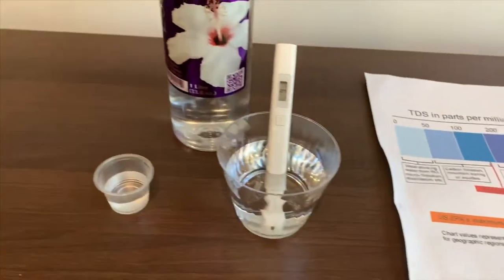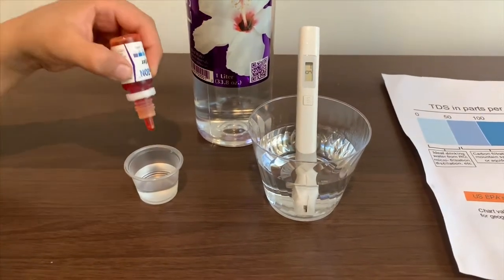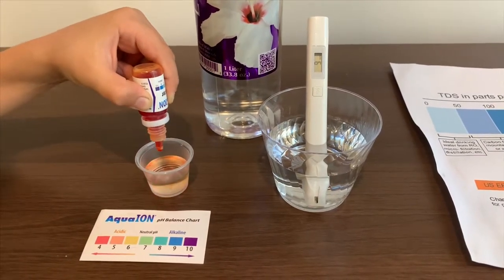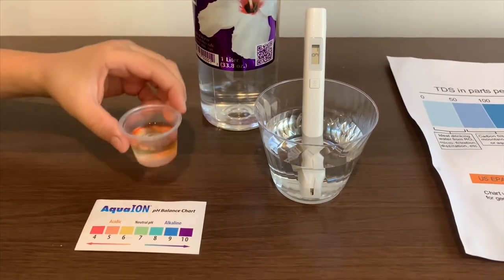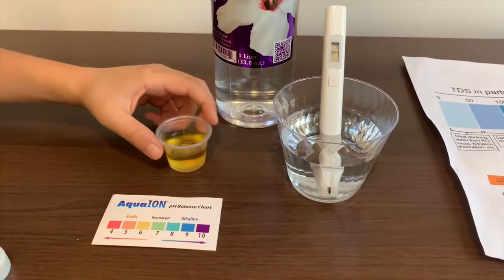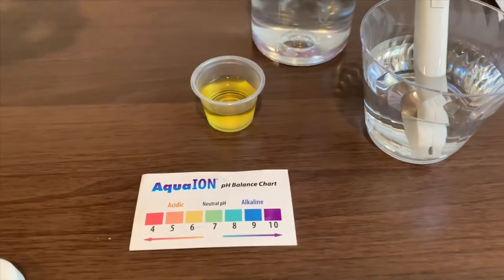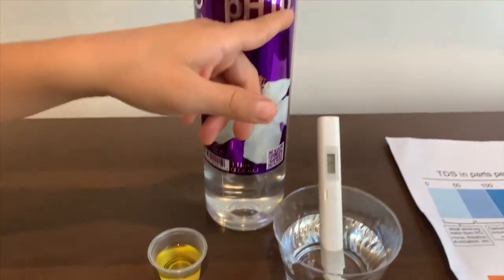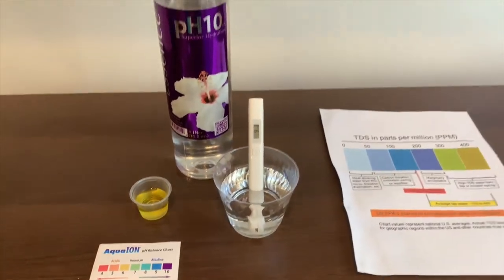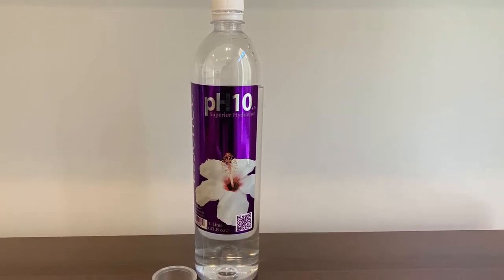Open the pH tester carefully and only do two drops — not more. One, two. This is yellow, which means it is acidic. That means it is not true that the pH is 10.